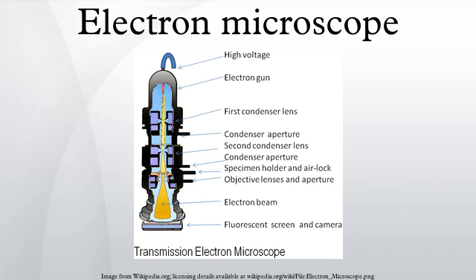Ion beam milling: thins samples until they are transparent to electrons by firing ions at the surface from an angle and sputtering material from the surface. A subclass of this is focused ion beam milling, where gallium ions are used to produce an electron transparent membrane in a specific region of the sample, for example through a device within a microprocessor. Ion beam milling may also be used for cross-section polishing prior to SEM analysis of materials that are difficult to prepare using mechanical polishing.